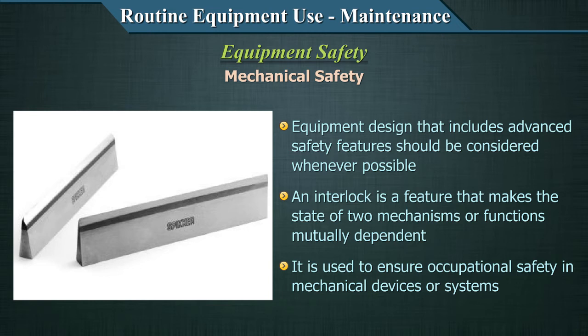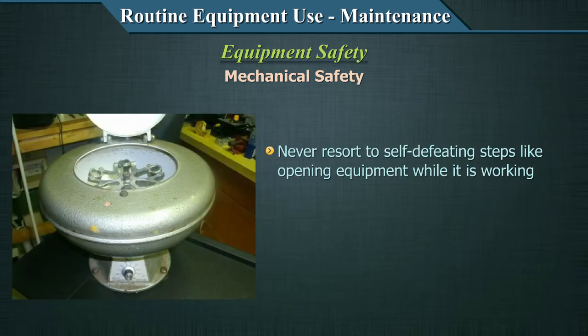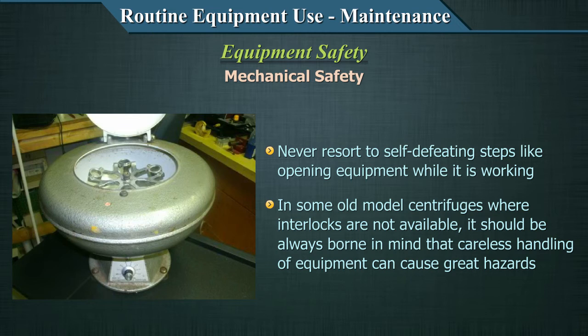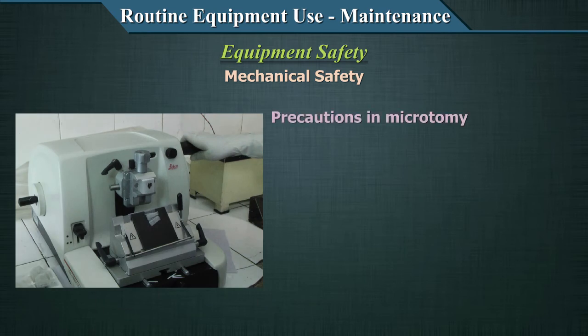Never resort to self-defeating steps like opening equipment while it is working. In old centrifuge models where interlocks are not available, careless handling can cause great hazards. Opening a centrifuge lid before it stops is very risky for two reasons: first, aerosolization of biohazardous samples containing airborne pathogens; second, broken test tubes can send glass fragments flying and cause injury. Another hazardous piece of equipment regarding physical safety is the microtome.